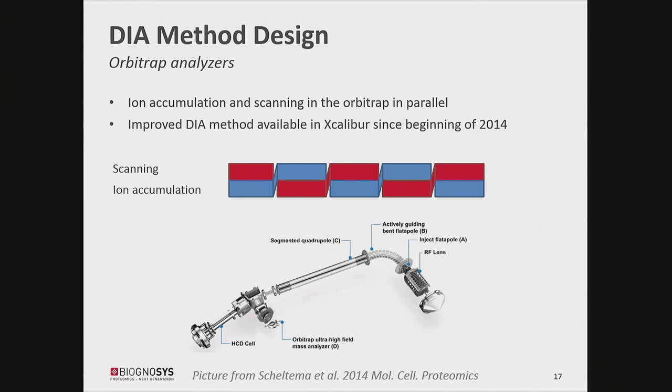Then another thing that was enabled in 2014 by Thermo: of course it makes a lot of sense to accumulate your ions while you are scanning. Before this wasn't possible on the Q Exactive, but since the beginning of 2014 you can do that, and it also improved the results quite dramatically.